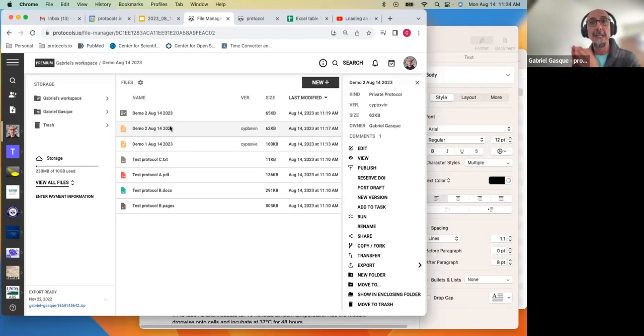And the best way to do that, let's say that you're putting together a series of protocols for a single manuscript. And these protocols share the same authors and share the same funding, but the content of the protocols is different from each other. So you can create a single template with all the metadata, authors, funding, and create multiple copies that then you can tailor individually. And these protocols are not related to one another in content.